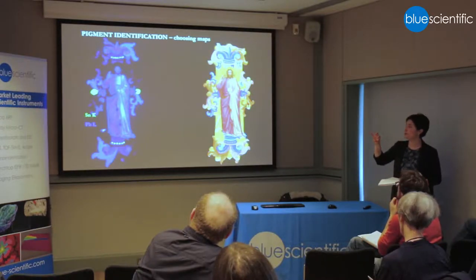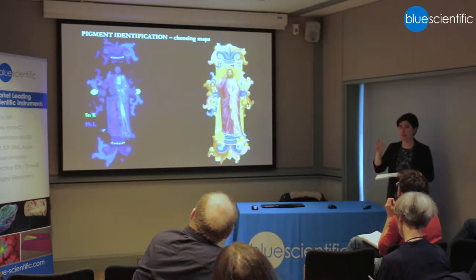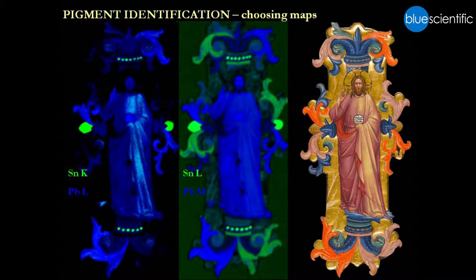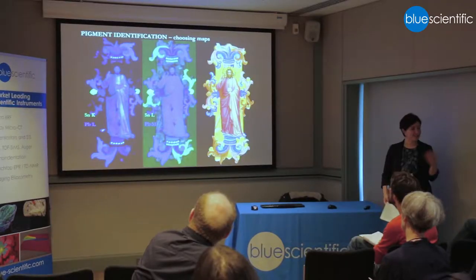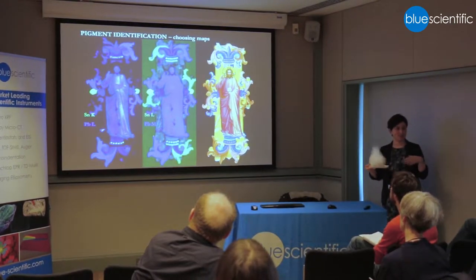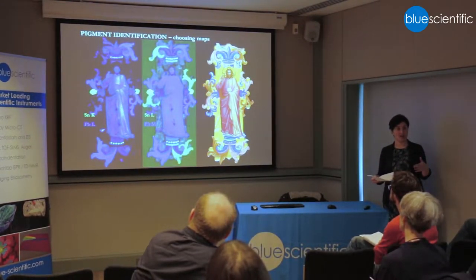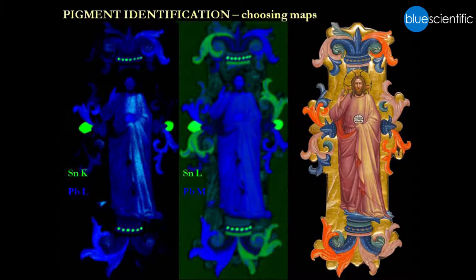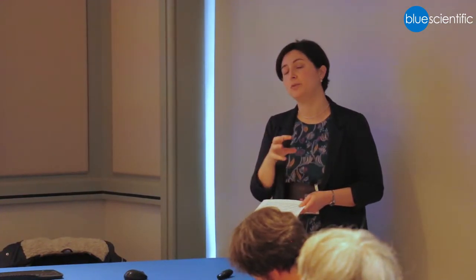What actually helps to distinguish the different pigments is the choice of spectral lines. I chose the tin K and lead L lines, but I could also choose the tin L and lead M lines. That image isn't as good — as has been mentioned already, you have the possibility to choose between different lines for the same element. These are the low-energy lines, and the image is noisier, partly because there is much more overlap between lines related to different elements in the low-energy area.